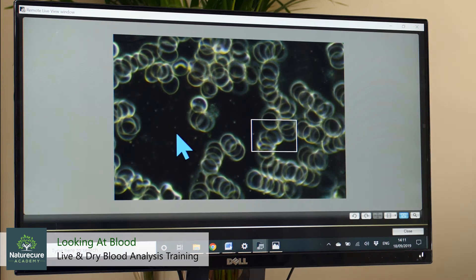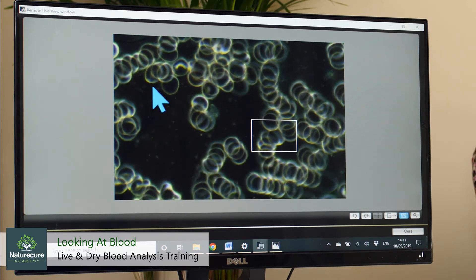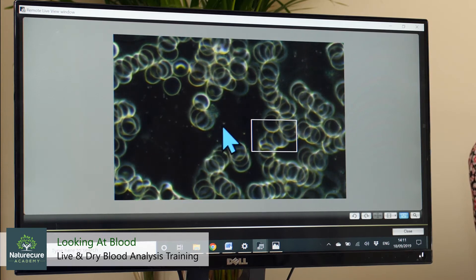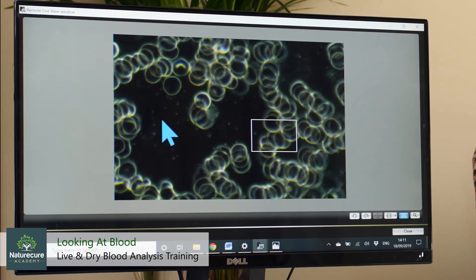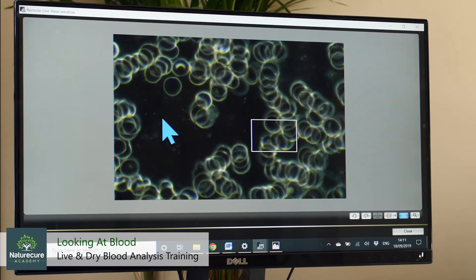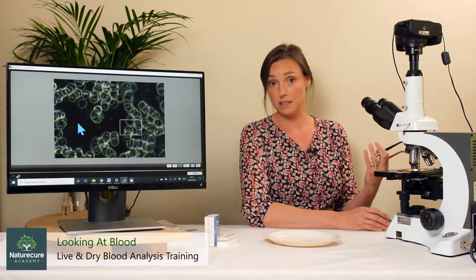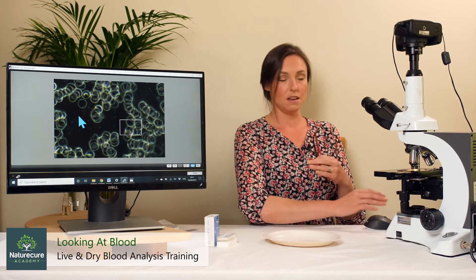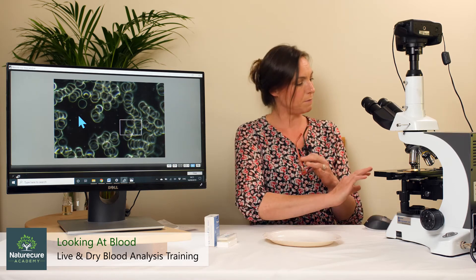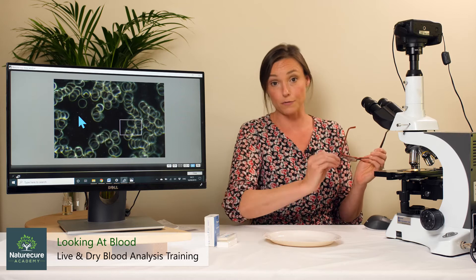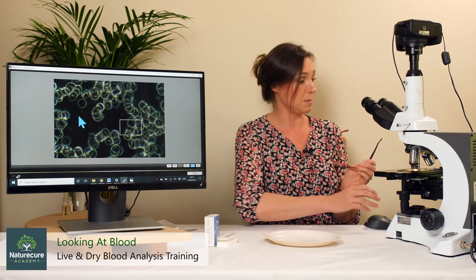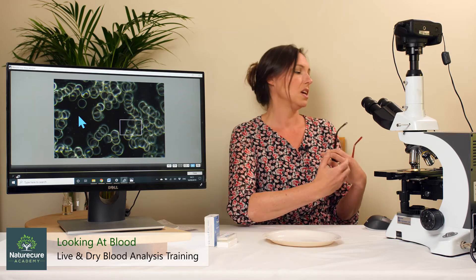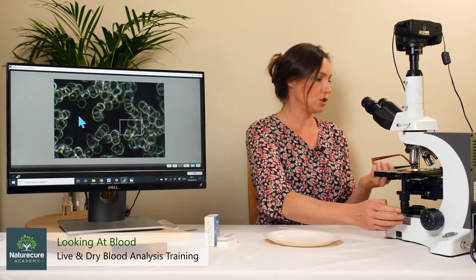Can you see lots of little particles buzzing around in the plasma? These could be food particles that are still being cleared out of my blood — it could be from the juice that I had. That would be expected if somebody had just eaten; the plasma would be full of these white particles floating around. It's not quite as much because I haven't had solids, just the juice, so these are the little particles from the juice floating around.